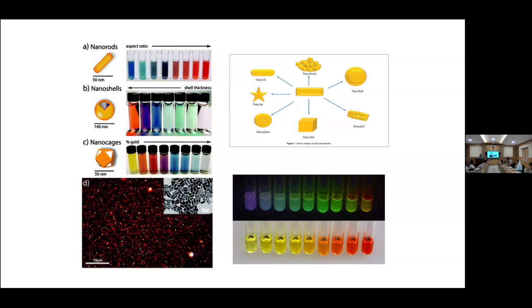In this case, we will check some other regions too. It's like 2-3 regions, we will take the EDS, then maybe we can see this zinc. That may be the possible reason because there is no other thing. There is no filtering or something, nothing is there. Yes, if you compare with XRD, that is the thing. In XRD, we are using a very bulk amount of sample. In TEM it is a very small amount.